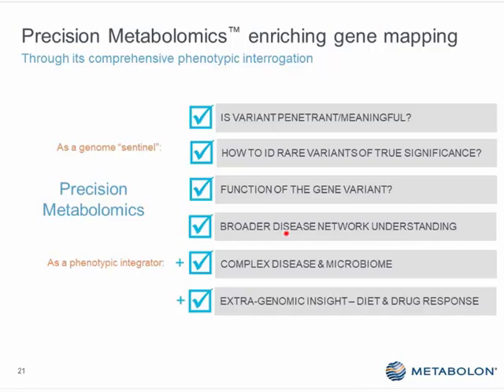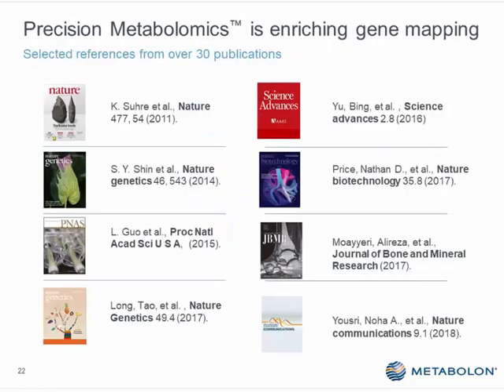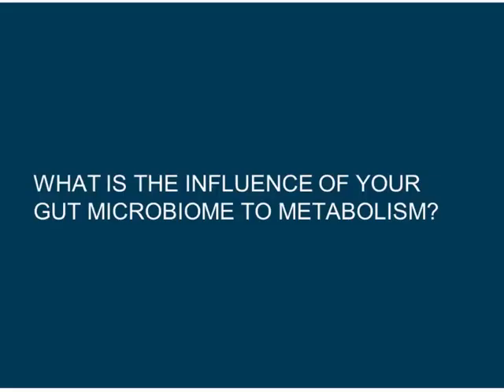And then in other cases, there are other genetic gene variants that are actually quite important that get missed because they're just not as well understood from the purely genetic side. And as I said before, this is now more than 50% of all the samples we run, not studies, I should say, combining this genetics with metabolomics. There are a lot of other papers that have been published in this space, and I encourage you to look at our website and our bibliography to find some of these.